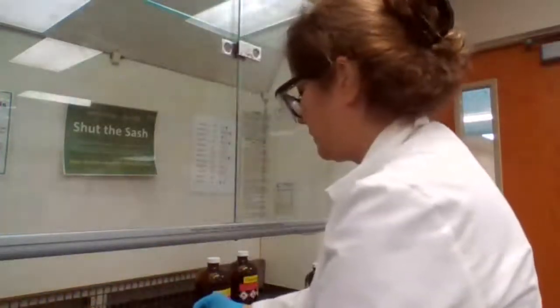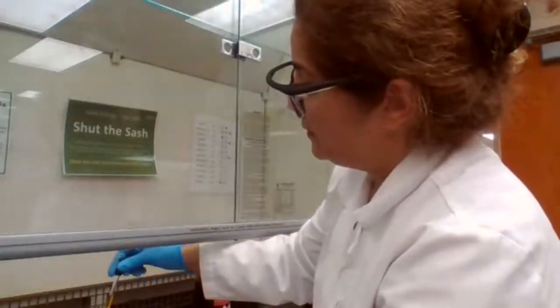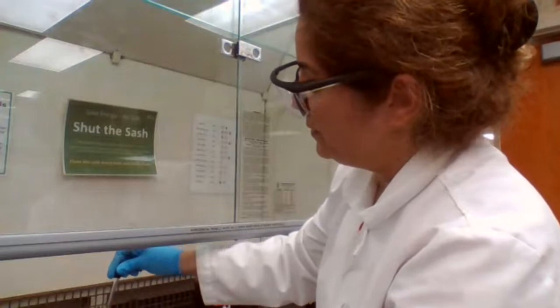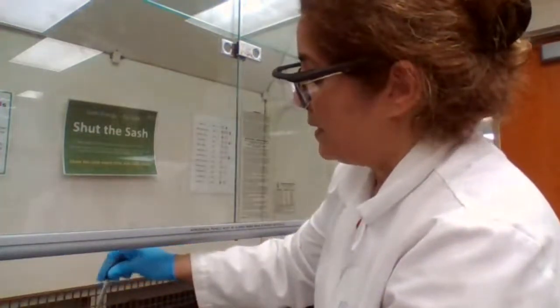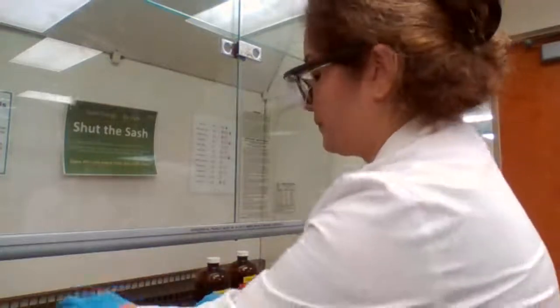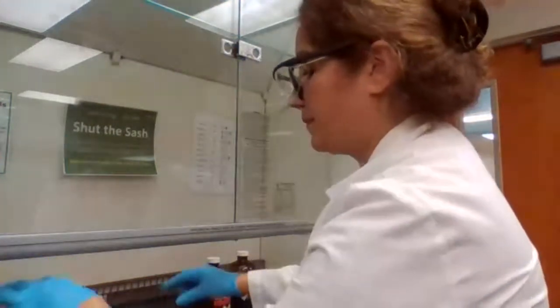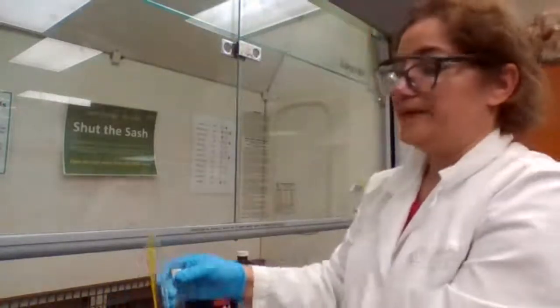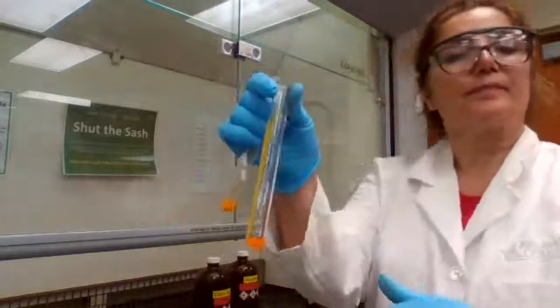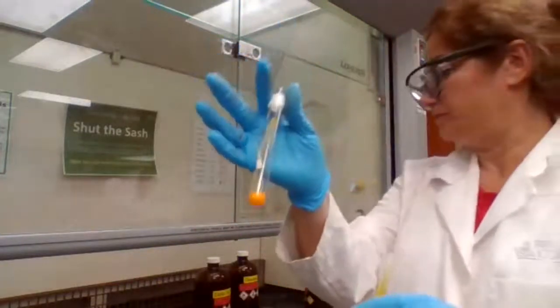Okay, going to add to C without touching the test tube, and D. Okay, test tube C and tube D.